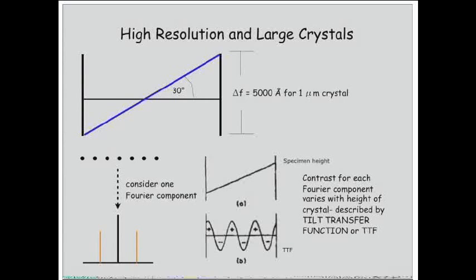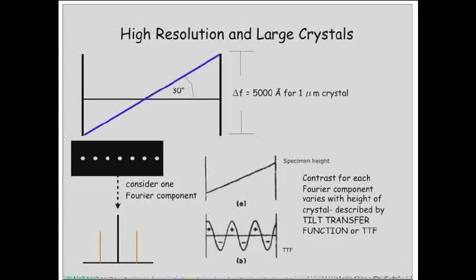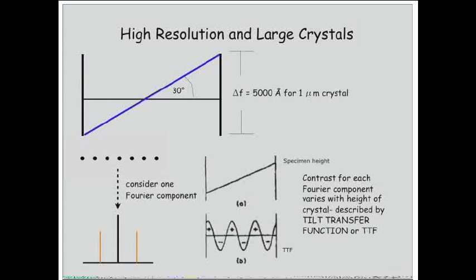So we start off, let's say, with a black feature on a white background. We oscillate through to a white feature on a black background, and then we get all sorts of intermediate stages, and at some points you get no contrast at all. And then we oscillate back again. So the contrast keeps oscillating as we travel across the image, and the defocus changes as we go across.